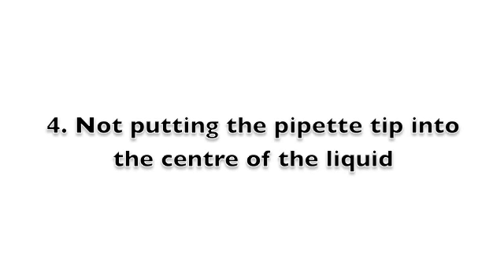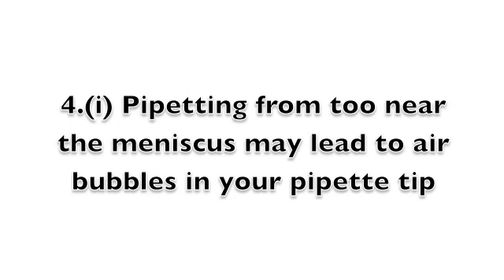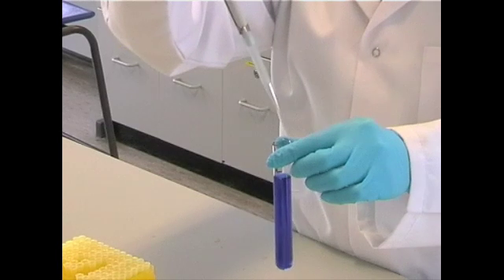Not putting the pipette tip into the center of the liquid may result in errors in pipetting. Specifically, pipetting from too near the meniscus may lead to air bubbles in your pipette tip, as shown here.